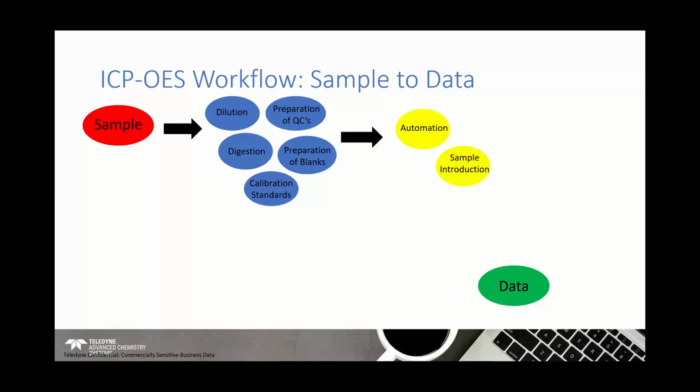instrumentation for measurement. After we've measured the analyte content and established our signal data from our samples, we then have some form of data output. In the case of a lot of instrumentation that's commercially available in the market today, this data might have been processed by the operating software, and what we actually get as an output is our end data point.